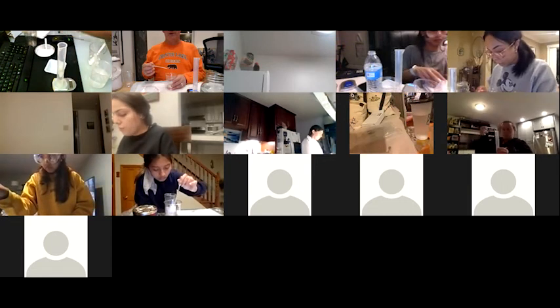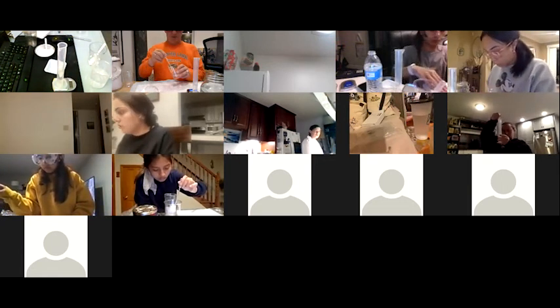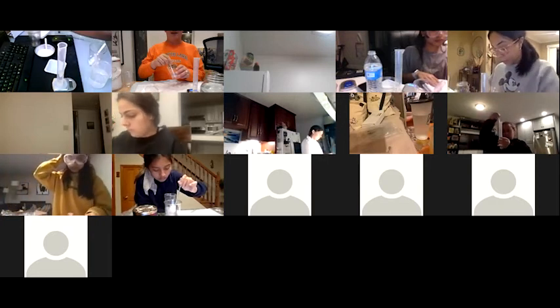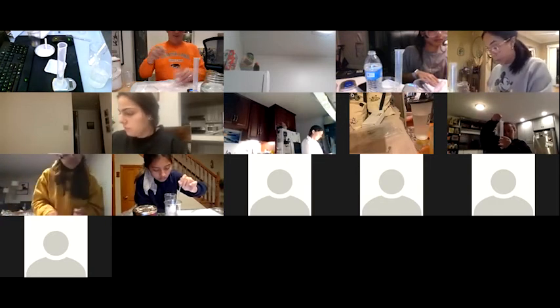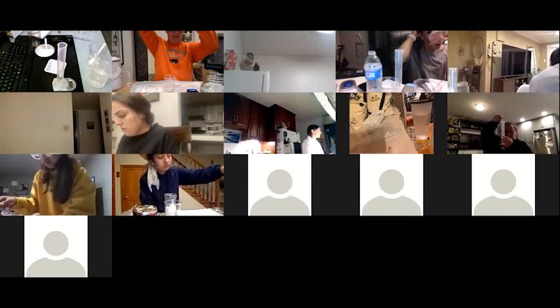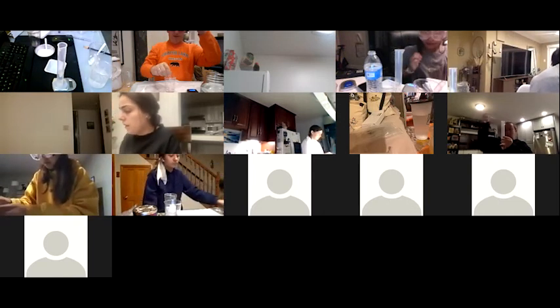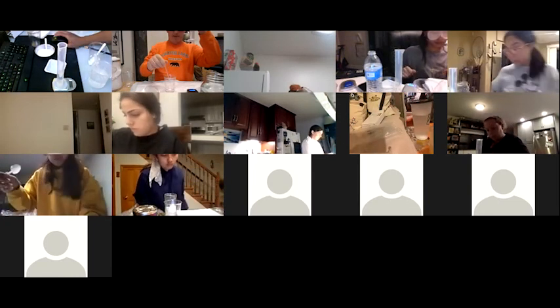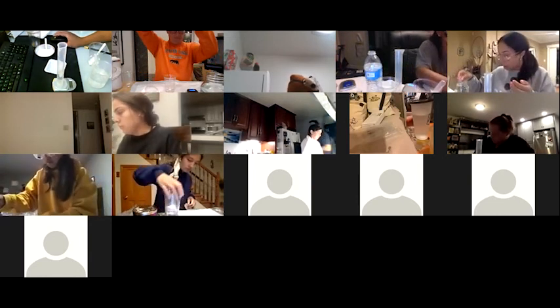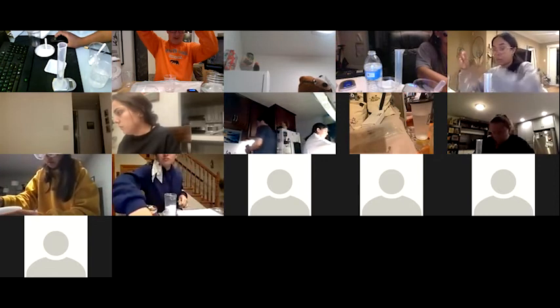You do them when you're using them. Once you've tared, then you add something to the cup. When you tare it, should it say 0? It should say 0 once you've tared it properly. It's the button on the right, the same as the power button.